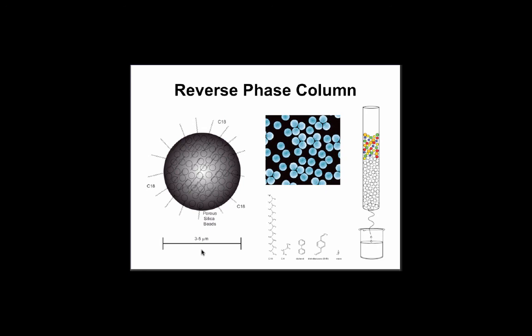And as with most things, you've probably heard about like dissolves like. So it's, again, the molecules that are similar to what's attached to the porous silica that stick or preferentially dissolve. Polar molecules don't like hydrophobic surfaces, and so they would slip through a reverse phase column very quickly.